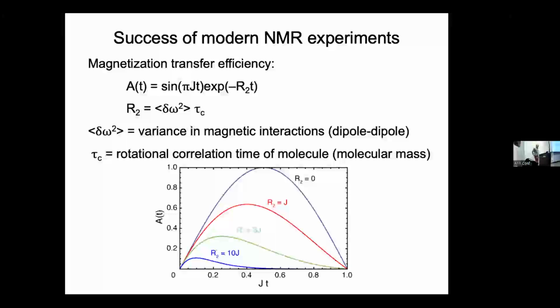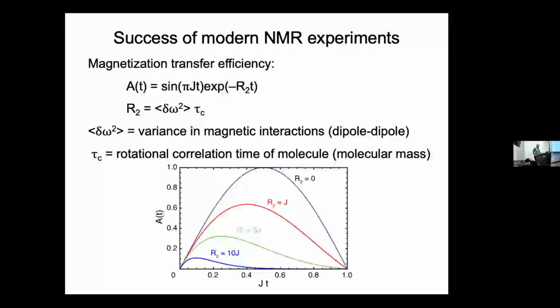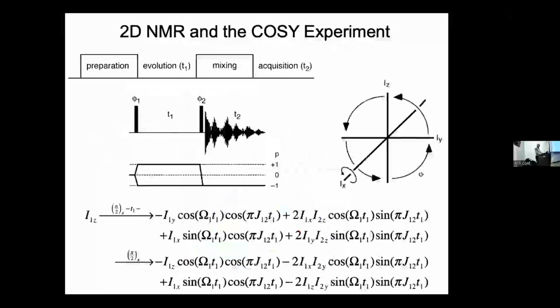But it's pretty remarkable to me that these two short equations are basically most of the box as to whether an NMR experiment is going to work. Now, if we come back here for a moment. The other thing I'd say is that these equations are short. So of course, if you're in need of more tattoos, you can fit these one on each arm, so you never forget these equations.